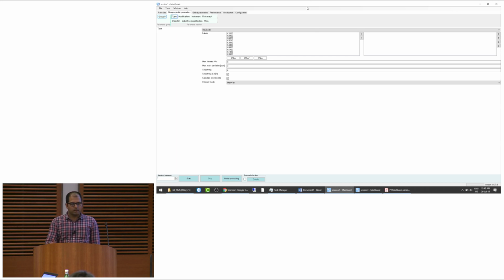Okay, so if we have to do an unspecific search, maybe we can just go through all the parameters we will change. And then I'm done.